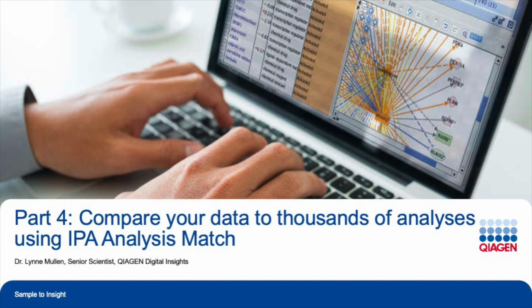Today I'm going to show you the analysis match tool, which is one of the newest and most powerful of IPA's features. It uses the power of IPA's causal analytics to compare your data with all of your IPA analyses, plus a massive set of publicly available data sets. And this can provide you with a unique option for making biological discoveries.